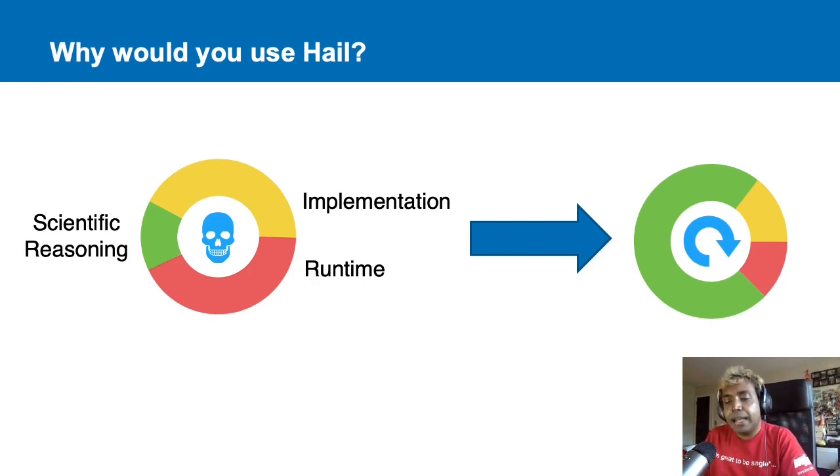On top of that, I also remember running VEP, which is an annotation tool to annotate each of the variants and what it means. It usually will take forever using cluster-based tools. So with Hail, VEP, using about, I want to say, 60 cluster nodes, which is kind of like 60 computers on the cloud, took about an hour, which I think is really fast for 4,000 genomes.